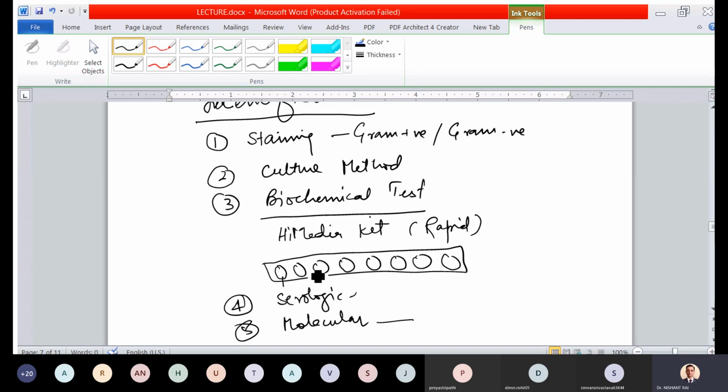Next step, start with the identification. Finally, you identify the bacteria. Once you identify the bacteria and you have isolated the bacteria in a pure form, you will do the preservation or maintenance. You will maintain the bacteria, right? And this method is used to get the bacteria of your interest. इंटरेस्ट का मतलब बैक्टीरिया जो किसी स्पेसिफिक पर्पज से आप यूज करना चाहते हैं, किसी भी आप मेटाबोलाइट आइसोलेट करना चाहते हैं, राइट? आप किसी तरह की कोई खास स्क्रीनिंग कर रहे हैं बैक्टीरिया की फॉर स्पेसिफिक इंडस्ट्रियल एप्लीकेशन और पर्पस, you will follow this method. So this is all about the method of isolation and identification.